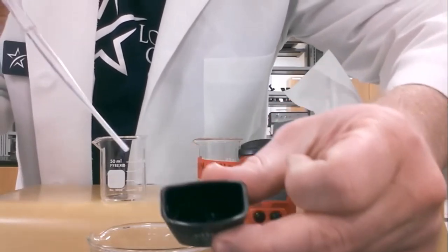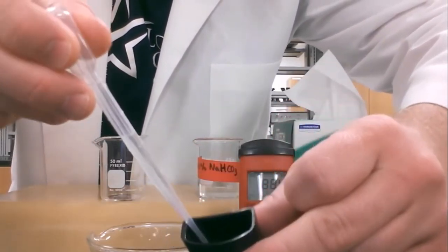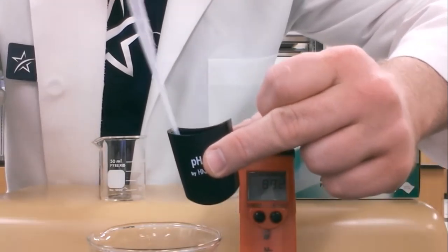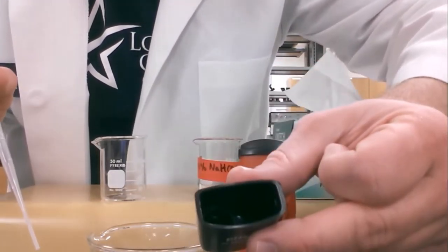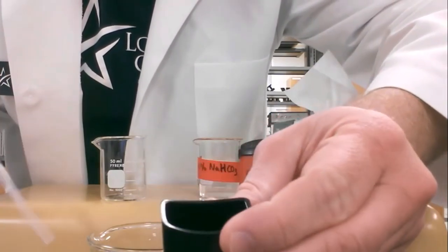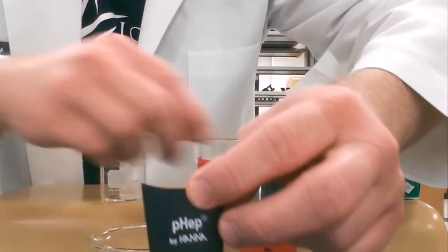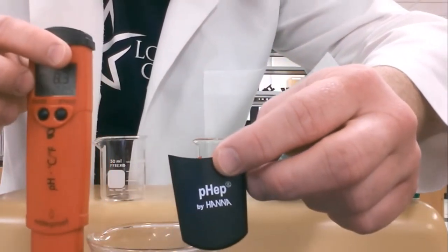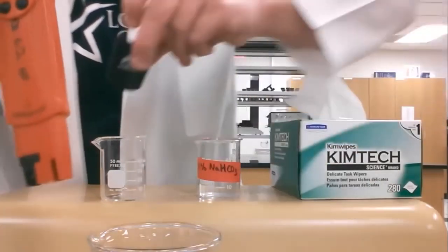And inside this cap, there's a small cylinder or circle. We're going to pipette the solution down in there. You may or may not be able to see that, but when you're doing this, look in there, you'll see it. And once you've done that, once that solution's in there, we're ready to put the pH meter back in there.